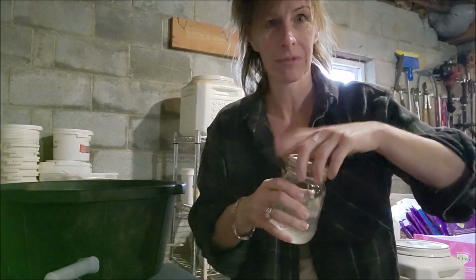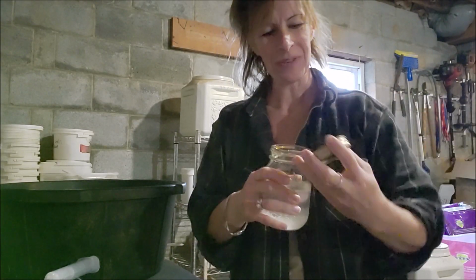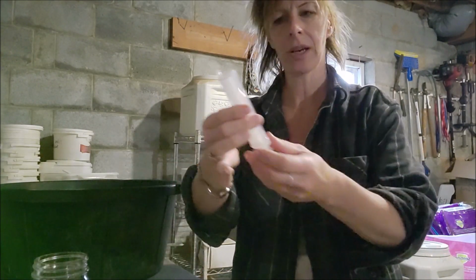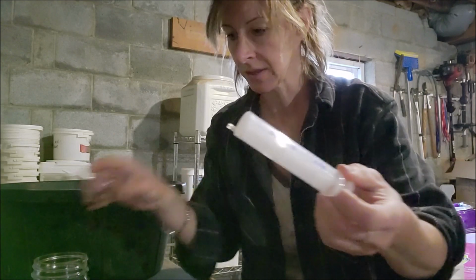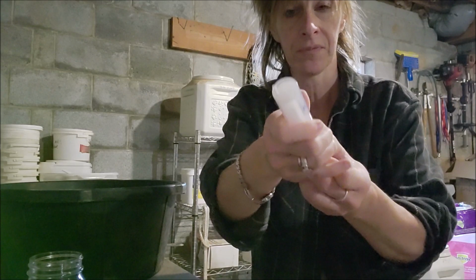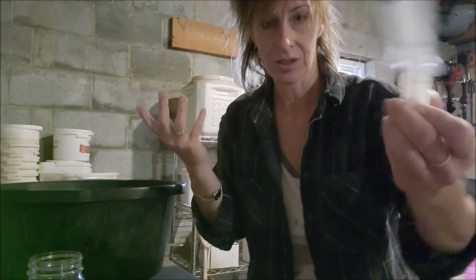So what we want to do is try to open the jar. Got it. Well, husbands are great. All right, so we open that, and then I do have something like this, just something to siphon some of this stuff up in. You can use a pipette, but this works great.